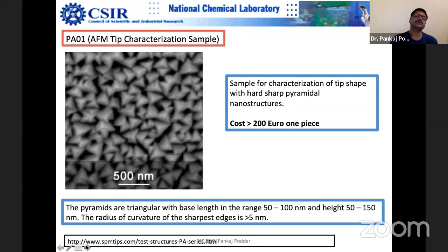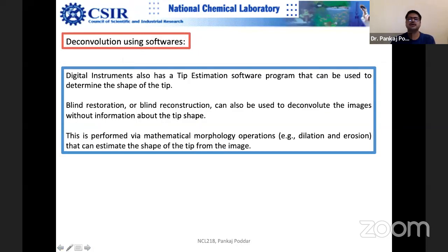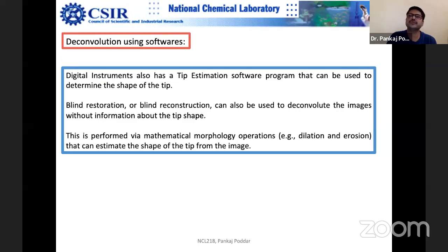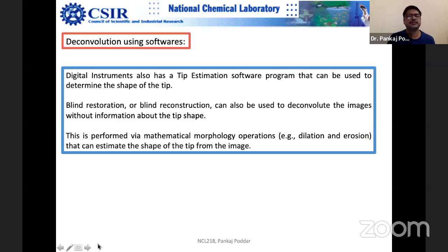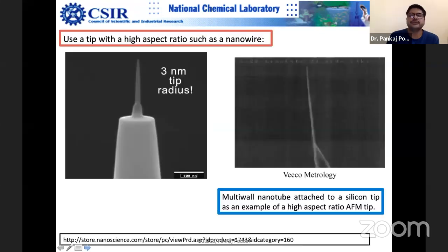I have not used deconvolution software because I don't trust it. I would prefer to put more effort on tip characterization and sharpening rather than using deconvolution software afterward. Applying software is essentially image manipulation — you are moving further from reality. For the sake of completeness I am showing that it is possible, but I prefer hardware solutions over software solutions.